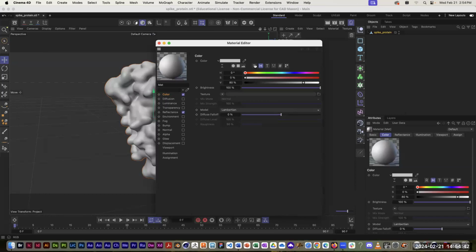But short of that, I'm going to click on the R, which is going to at least let me create colors in RGB. My brain can kind of think in RGB a little bit. So if I play around with these RGB sliders, I can specify different colors.